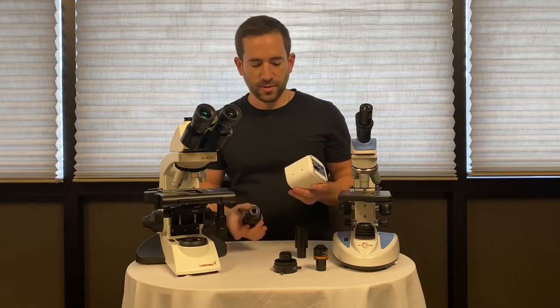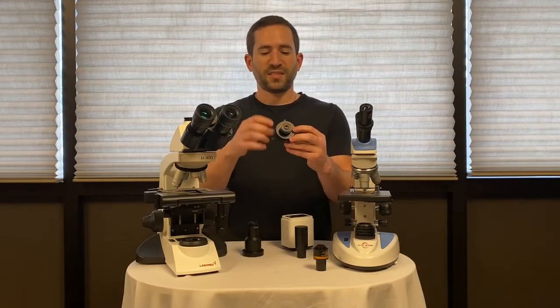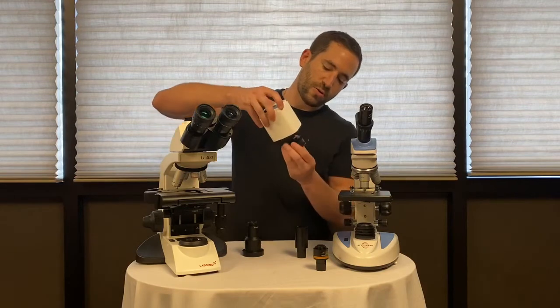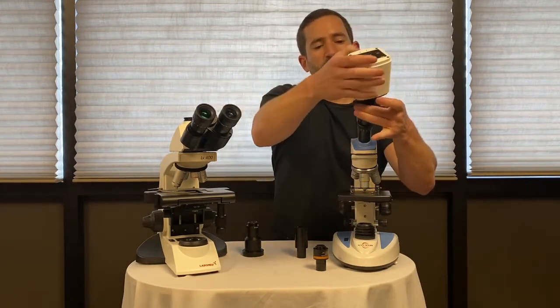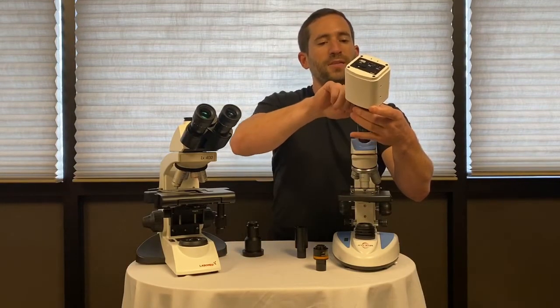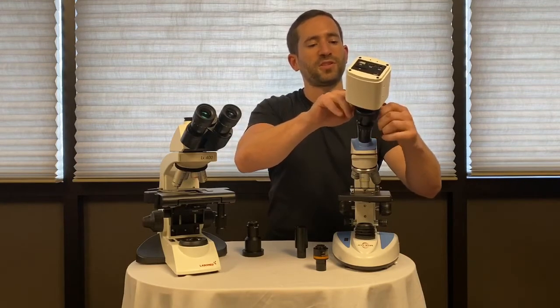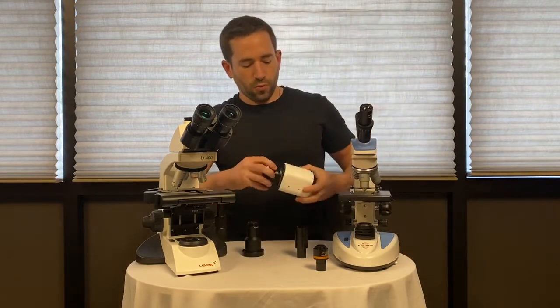If you don't have a trinocular head, no problem — there are two other options. The first is with an over-the-eyepiece adapter. It has a C-mount top, so you simply screw the camera onto the threads and with three thumb screws tighten the camera over the eyepiece. This method is not preferred as it's cumbersome and can be difficult to secure over the eyepiece.